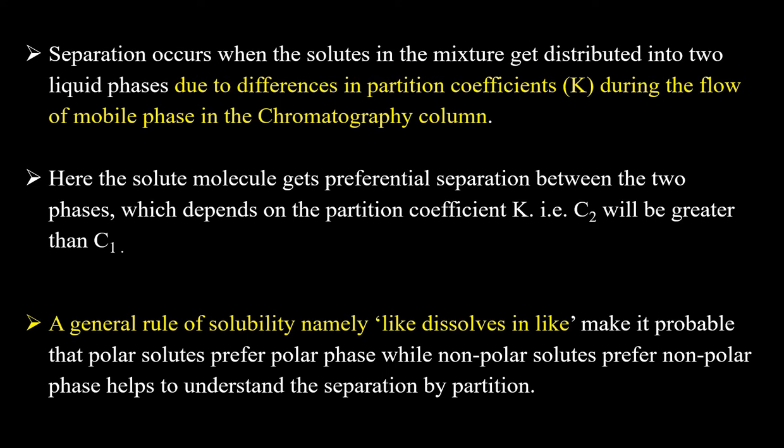A general rule of solubility, therefore, "like dissolves in like", makes it probable that the polar solute prefers the polar phase, whereas the non-polar solute prefers the non-polar phase. This helps to understand the separation by partition.